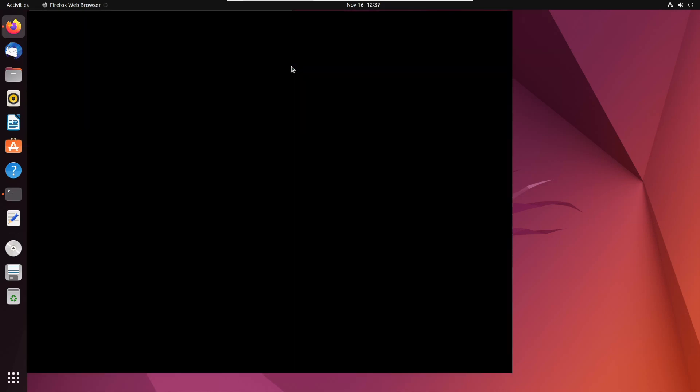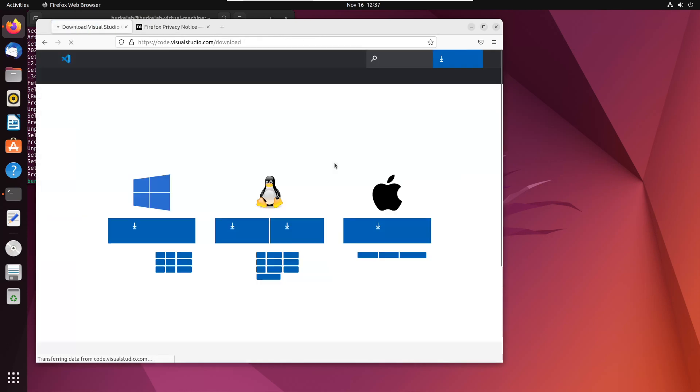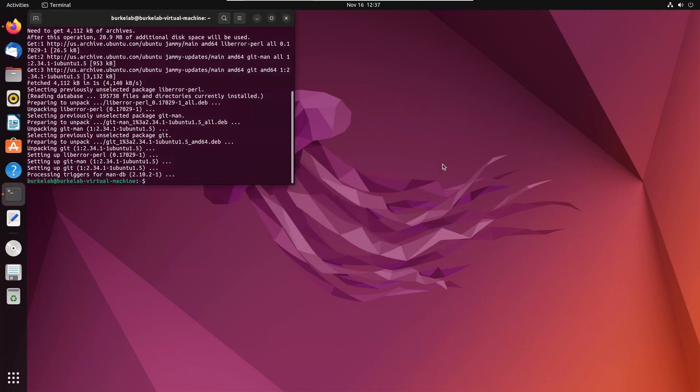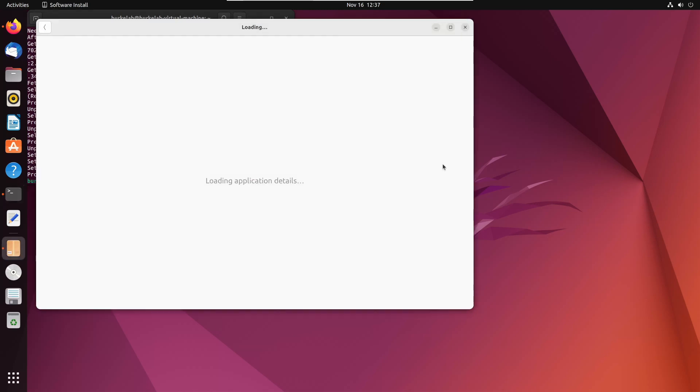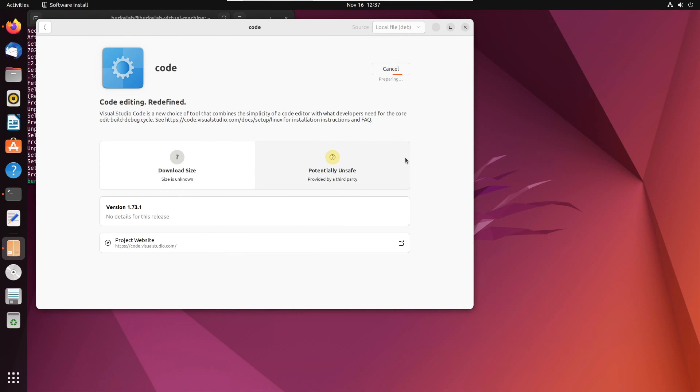Now we need to install Visual Studio Code, which is the IDE I recommend you use. It allows you to compile and upload the firmware. We download it from the Visual Studio Code website, download the Debian package, open it, and install it with the software installer. Type your password and click Install. These commands will also be described in the README file on the GitHub.